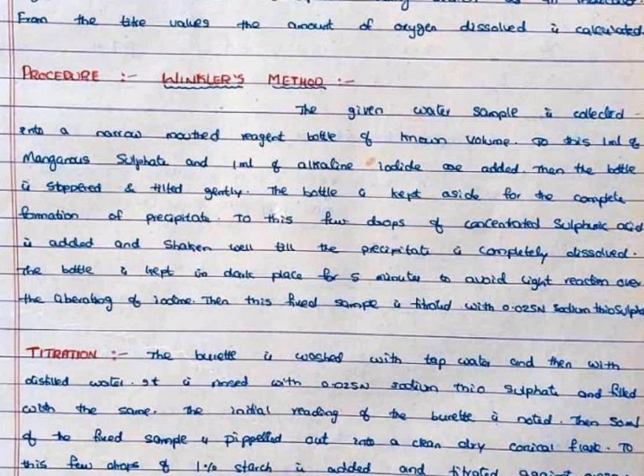Then this fixed sample is titrated with sodium thiosulfate.